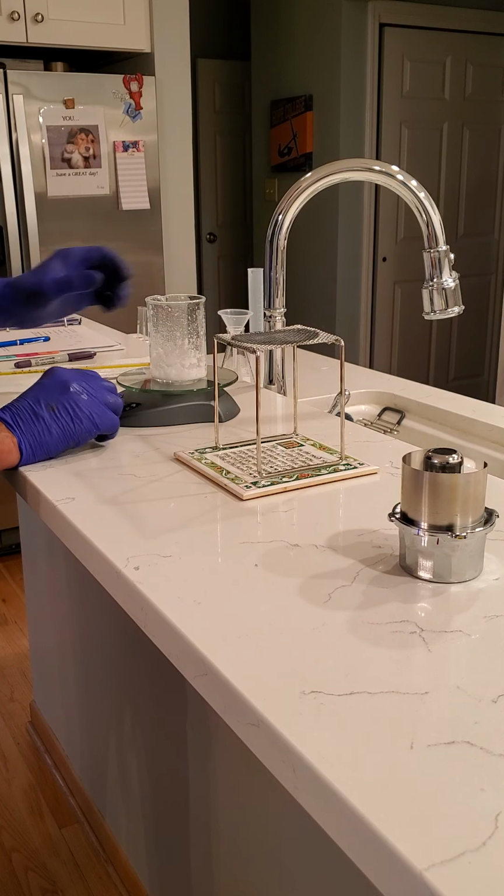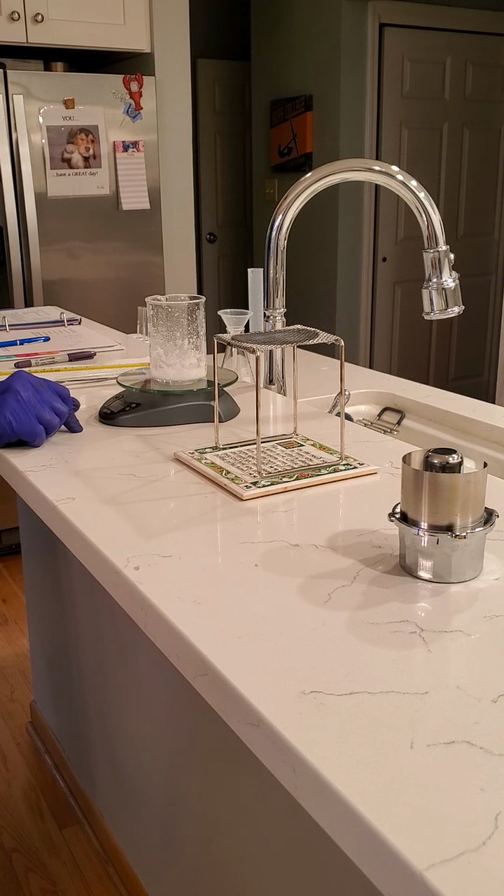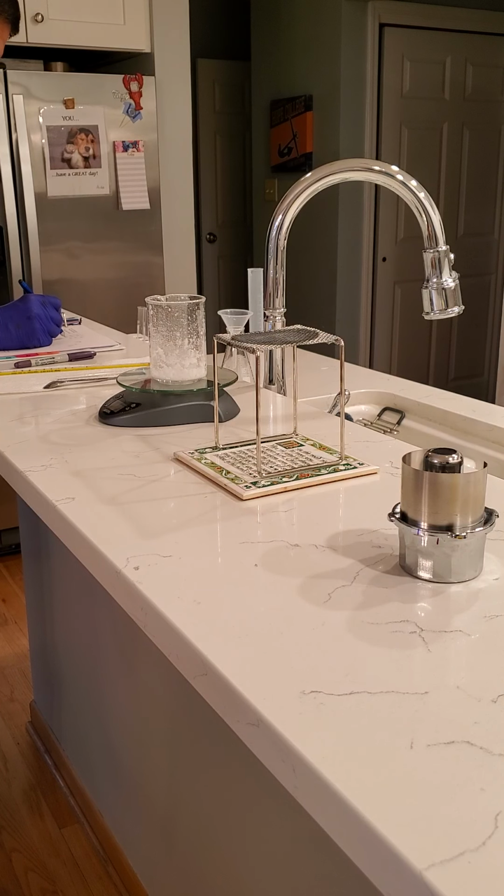And we have for our beaker plus salt, our solute, 131 grams, which makes sense since our beaker plus the solution was 161 grams.